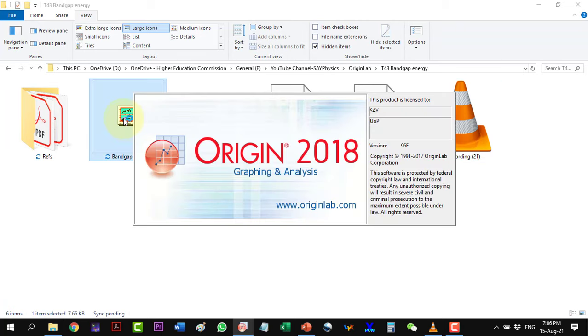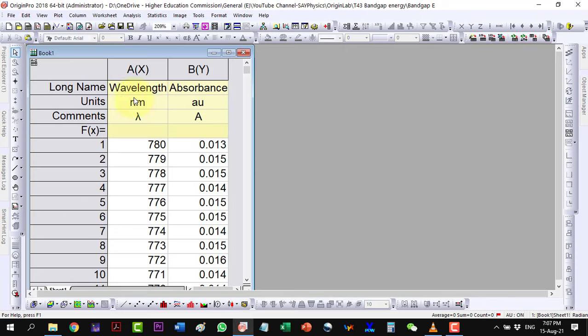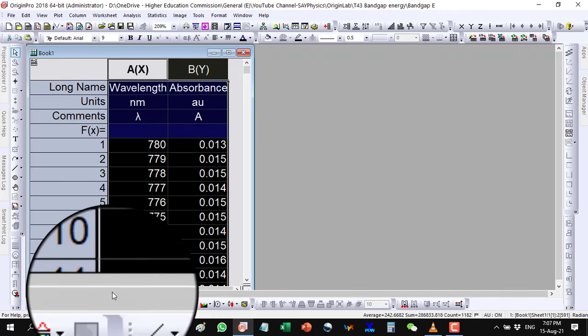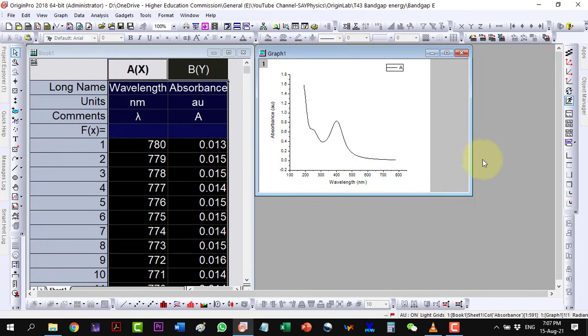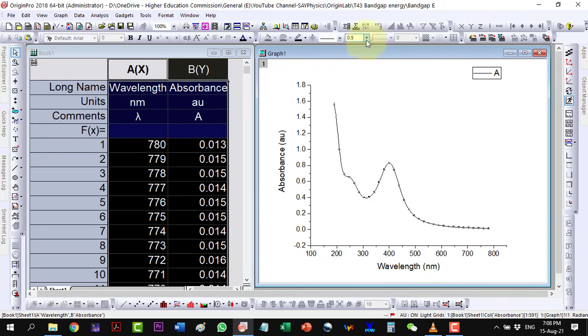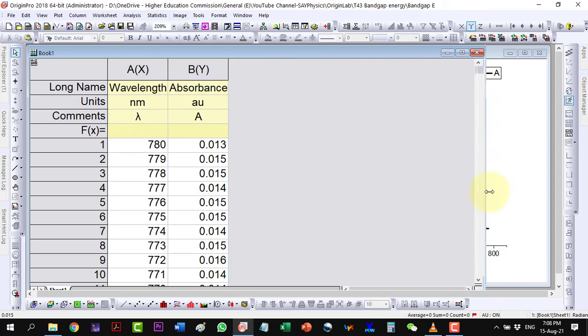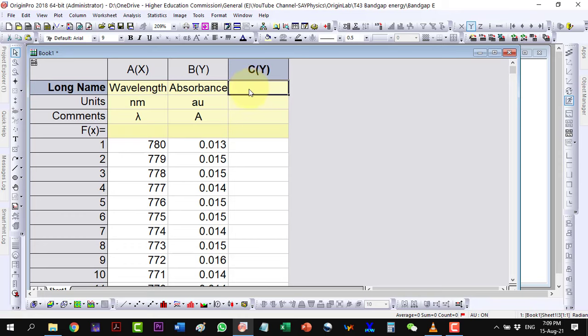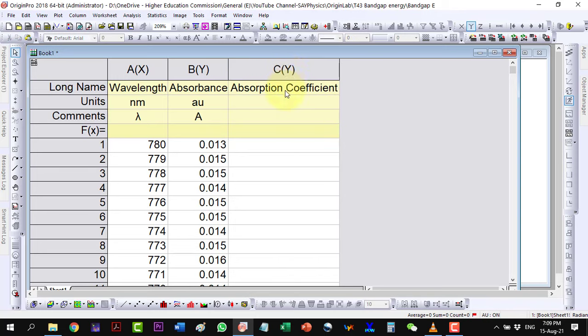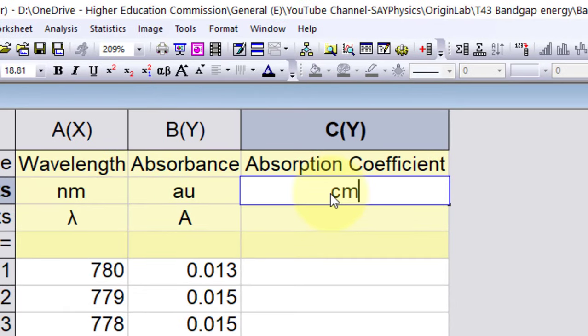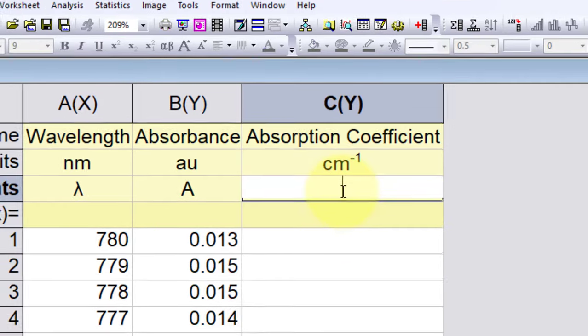Now, we will start with the UV-Vis data in Origin. The first column shows the wavelength in nanometers, while the second shows the absorbance. Let us plot the data. Here, we will first find the absorption coefficient alpha by adding an additional column.